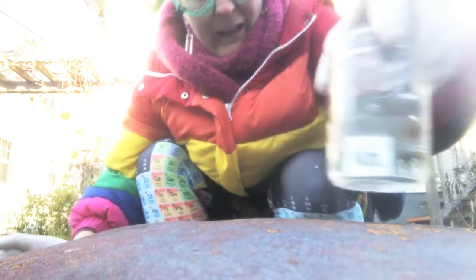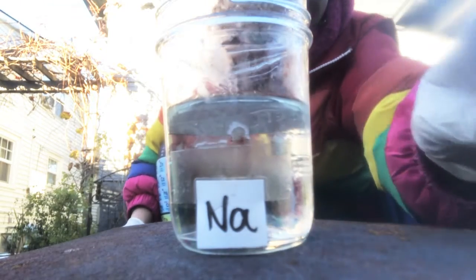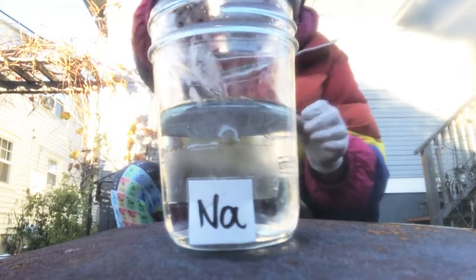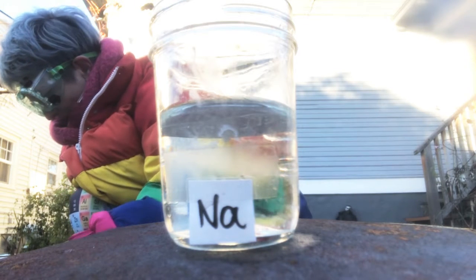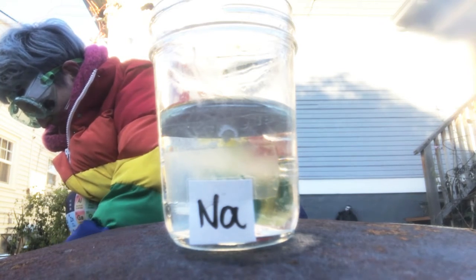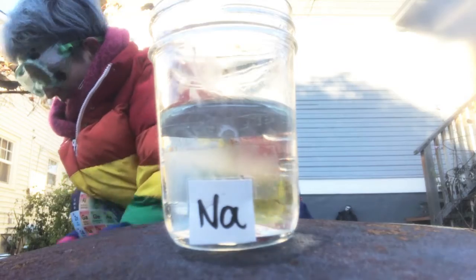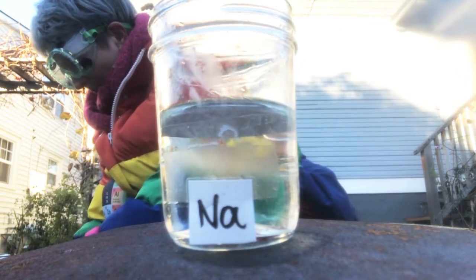And then we've got sodium. So if you are already figuring out that the sodium might be a little more reactive than that lithium, that might be a thing. So here we are. Gonna get a piece of sodium from our jar here. All right, here we go. I cut it in half. It's a little bit silvery, but most of it's pretty silver. I screw on that lid.